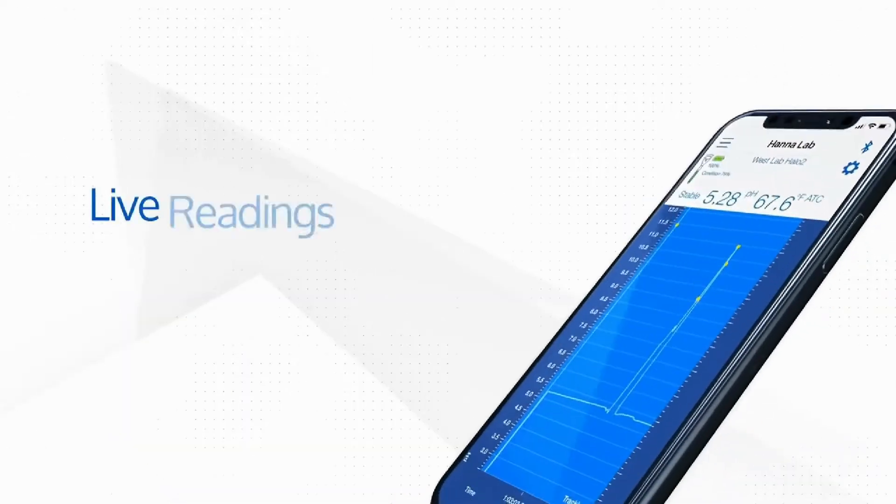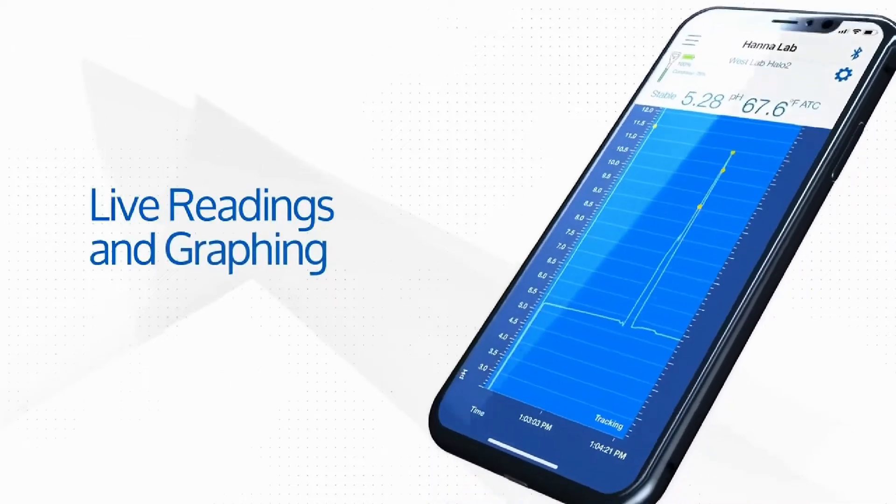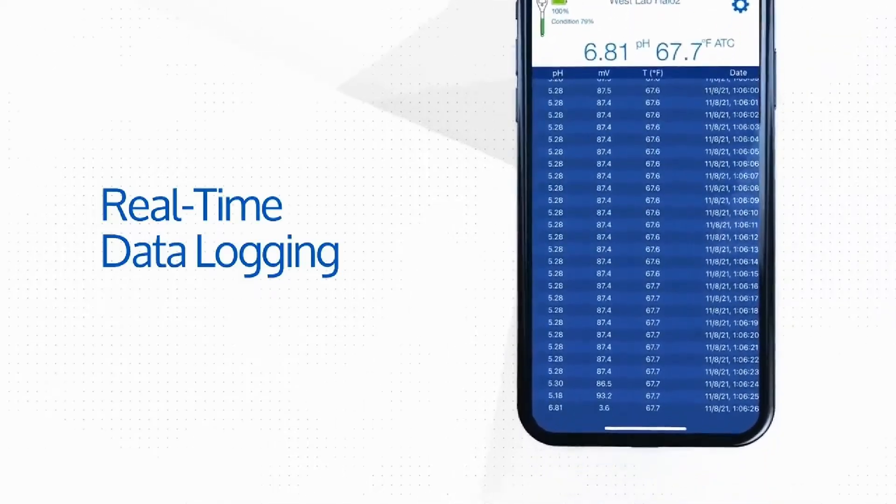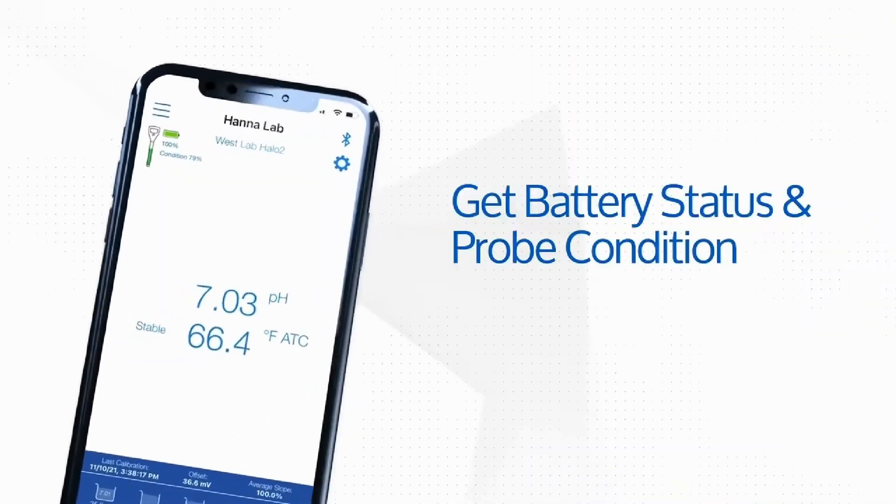It also gives you live readings and graphings of your current sample pH and temperature for HACCP record-keeping and real-time data logging. In addition, it shows you your current battery status and pH probe condition.